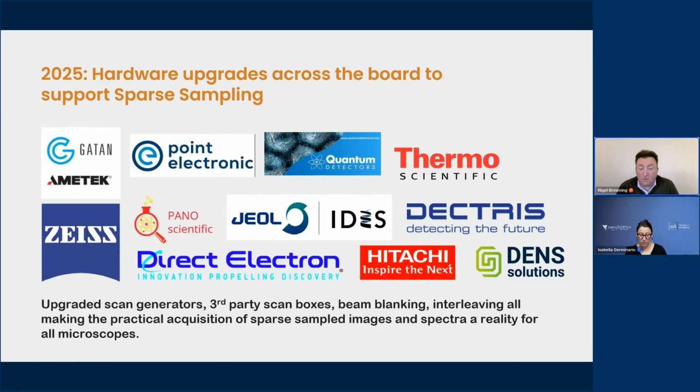So then you can go through and use applications, and those applications can be in situ microscopy, high resolution microscopy, volume EM, all of those things. And if you look at the list here, you're pretty much looking at covering most of the hardware that you can use on advanced electron microscopy and have the capability of being able to acquire a random scan or a subsample scan in that process. So on every microscope nowadays, it's essentially a reality that you can do sparse sampling, or you can do sparse sampling with a very simple upgrade to the system. Next slide, please.